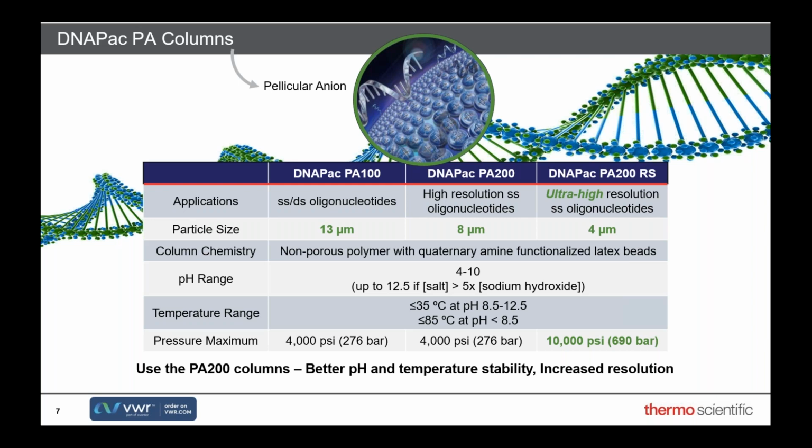Now, that's a 20-year-old column. This column used to be called the Nucleopack column. It's the same column, it underwent a name change. But this is an old column brought out before Thermo Fisher Scientific had even acquired Dionex. So it was a Dionex column at the time. The new columns are much better.